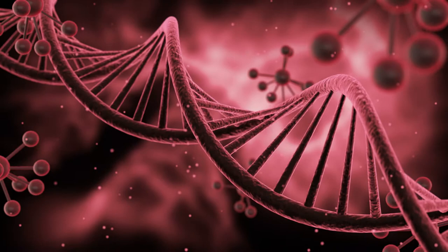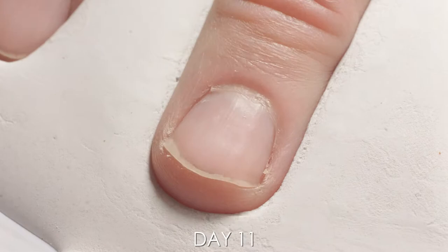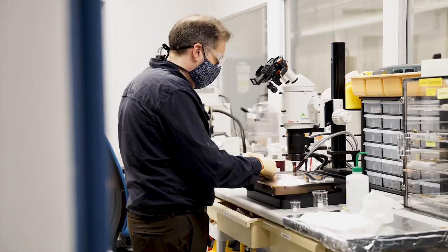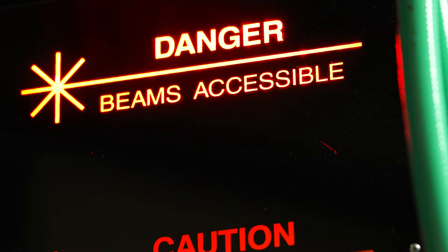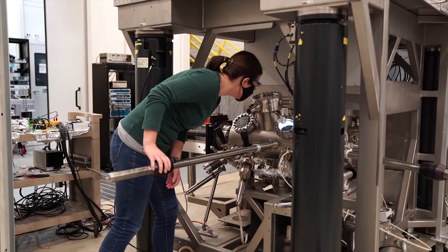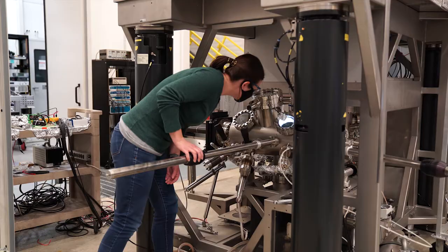A strand of human DNA is about 2.5 nanometers in diameter, and fingernails grow about 1 nanometer per second. To study objects at this scale, scientists need tools much more powerful than the standard microscope in a classroom. Microscopes at CNM use ultra-low temperatures, X-rays, and lasers to achieve high enough resolution to study nano-sized objects. These microscopes can examine materials with up to 500 times the magnification of a standard light microscope.